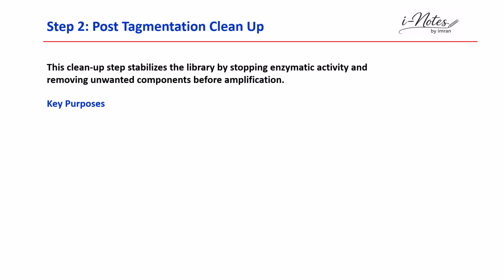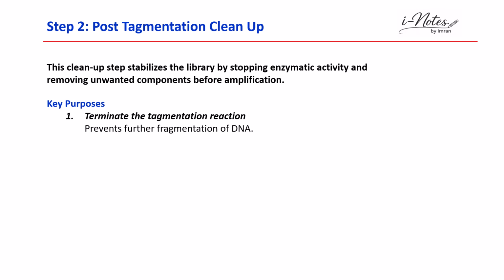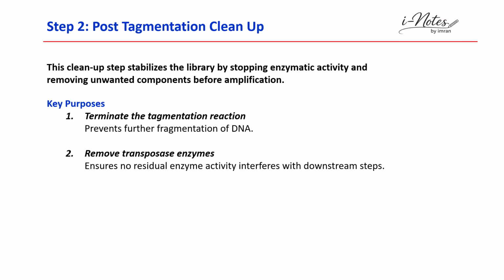The key purposes of this post-tagmentation cleanup are to terminate the tagmentation reaction so that there is no over-tagmentation, to stop the tagmentation process and prevent further fragmentation, and also to remove the transposase enzyme so that there is no interference in the downstream process.